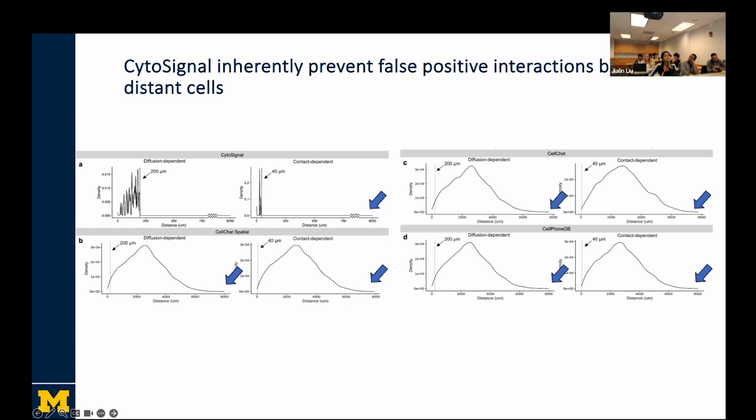But this is a big overall summary of how many interactions you had. Looking at an individual cell interacting with so many neighbors, are you finding a similar population within CellChat, given you set an upper bound of 200? Since CellChat spatial is at cluster level, they're only telling you which cluster is interacting with each cluster.